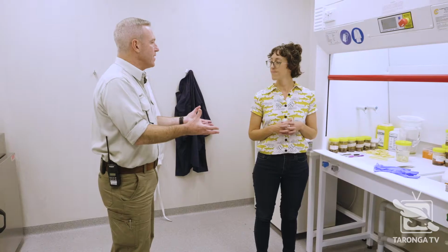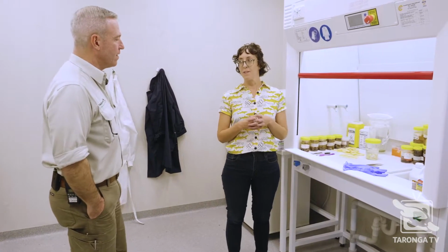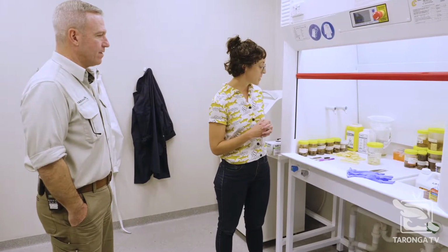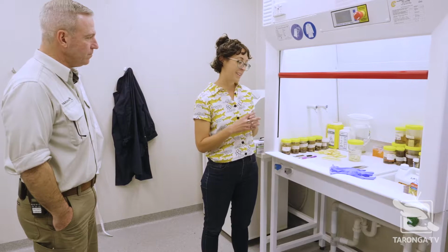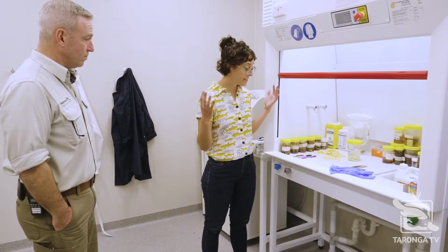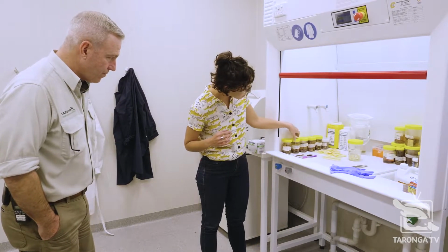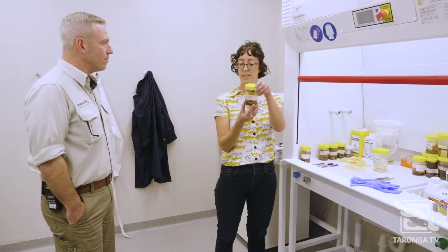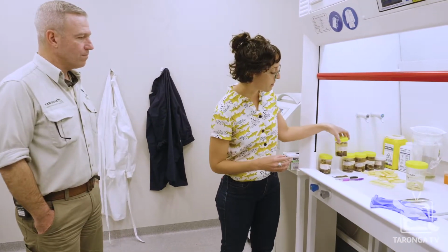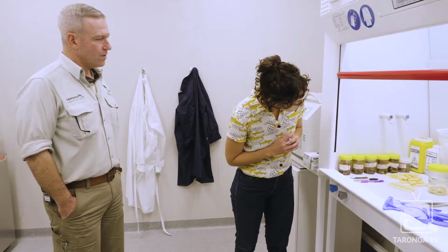We used the whale as an example. Can you tell us about some of the other samples that you've got there? Yeah, so we've got a few mortality investigations going on at the moment. So you can see that we've started with an animal that is as large as a whale, or perhaps a long-nosed bandicoot or a ring-tailed possum. But by the time they come to the lab, they're actually trimmed down into small sizes so that we can actually get them processed and looked at under the microscope. So yeah, we've got quite a few things going on.